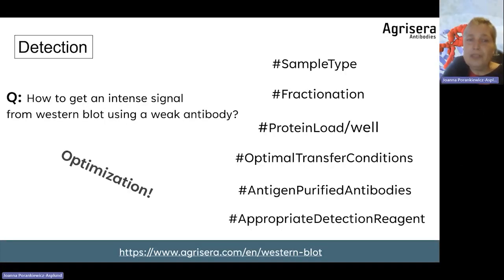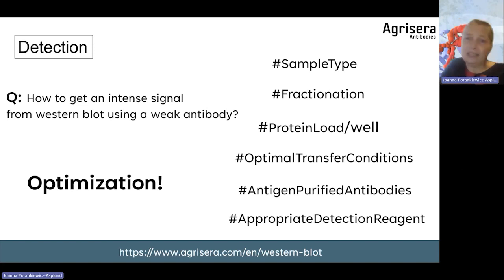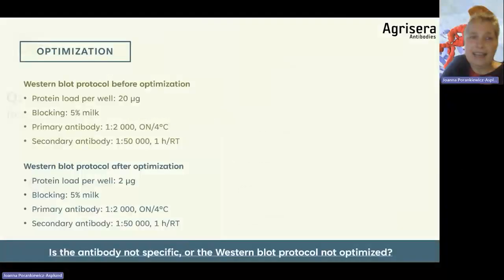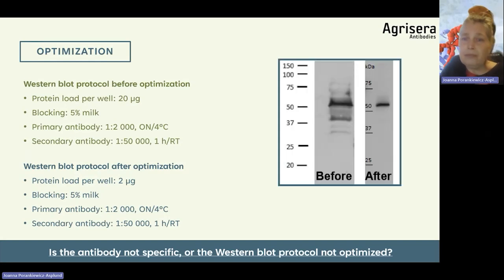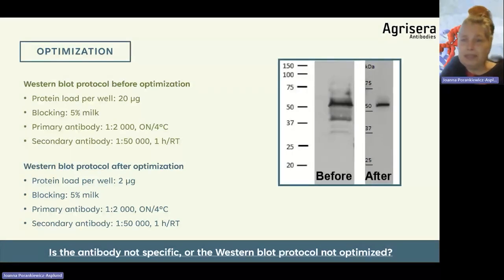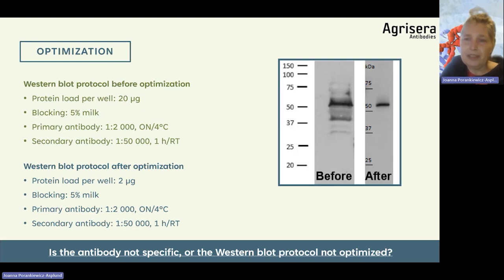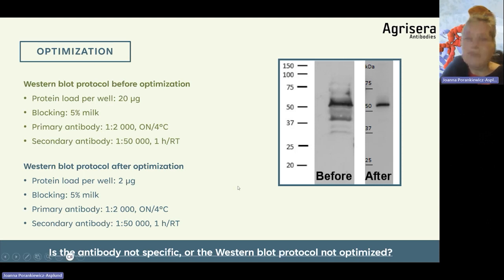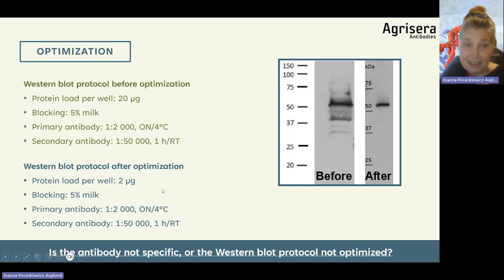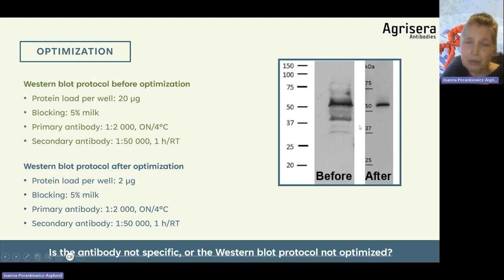All of this is called optimization, which I was walking you through today. I would like to show you an example of optimization before and after. Here you can see a Western blot protocol optimization where only one parameter was changed — the protein load per well.